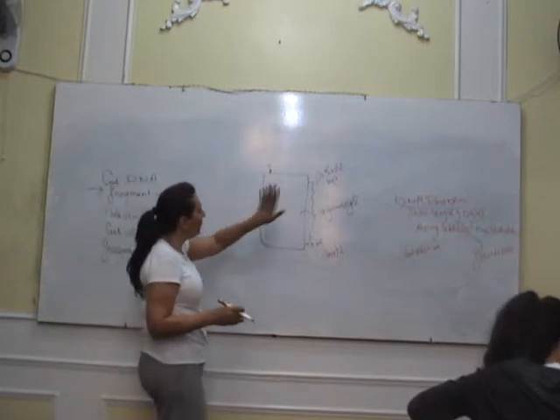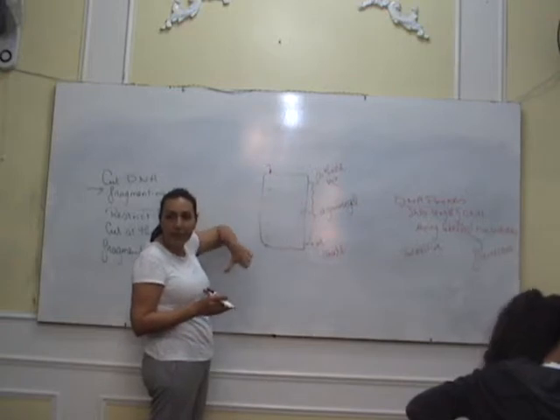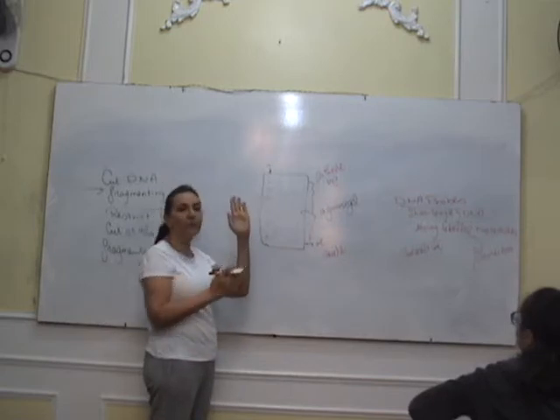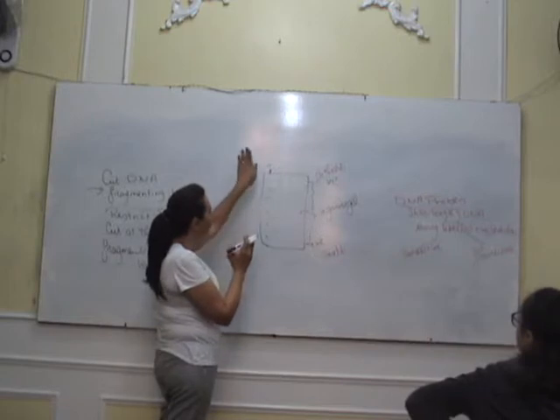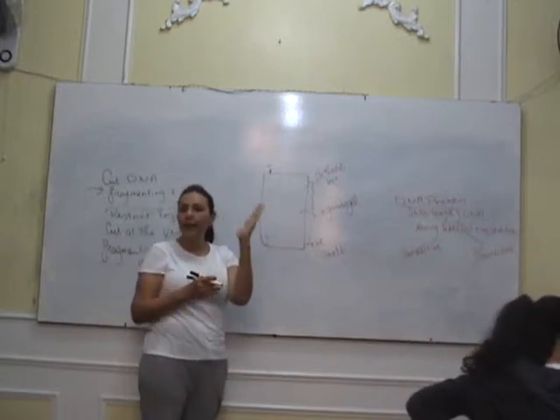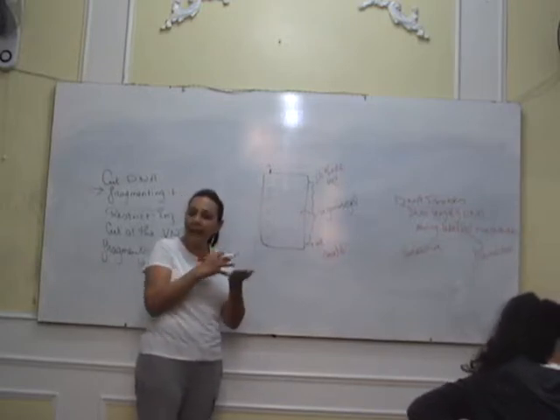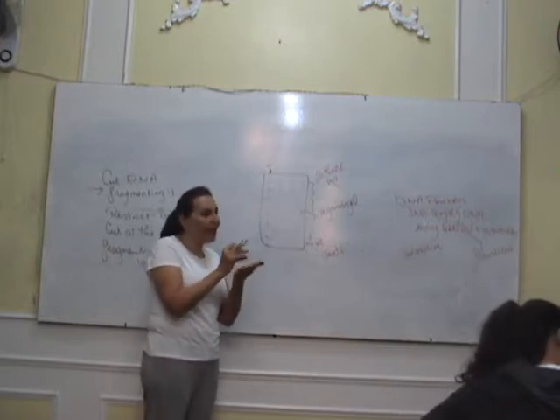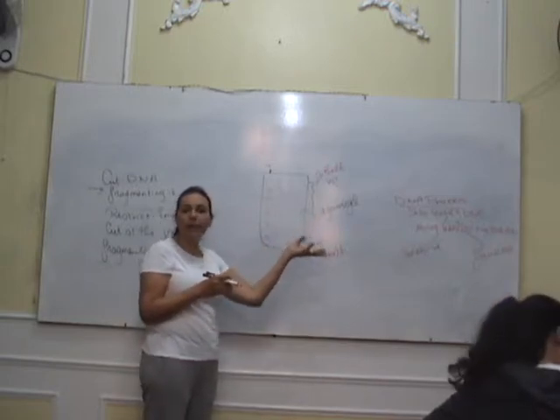We put an absorbent paper over the gel electrophoresis tray in order to transfer the DNA fragments onto this paper. Then we heat the absorbent paper in order to separate the two strands of the DNA fragments from each other, so that I have single strands. And then we put the DNA probes.